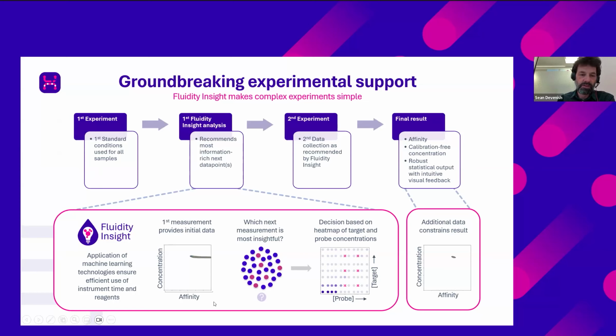So this would be an example of an initial analysis. You can see we still have quite a poorly constrained result with a long tail off to the right-hand side here. Obviously, as an experimenter, looking at this, it's fairly opaque, a little bit hard to know what I actually need to do to improve this situation.